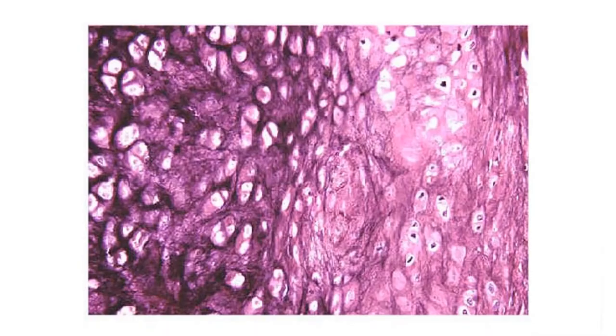Okay, what's here? More eyes in the jungle. Chondrocytes sitting in lacunae, but check out the matrix, right? It's dirty. It's cracked. It's elastic. Elastic cartilage, right? So, where would I find elastic cartilage? Well, in the pinna of the ear, in the epiglottis, in the throat, and not many other places, to be honest. It's very limited distribution, but this is elastic cartilage. What's the function? Support, but also some sort of elastic support, some resiliency, some spring back effect.